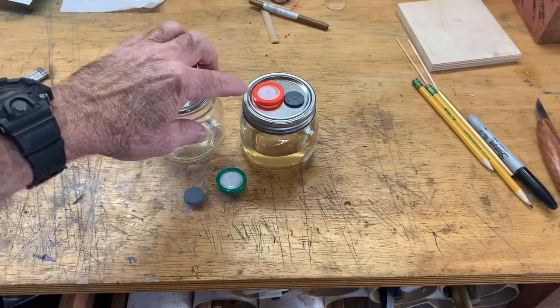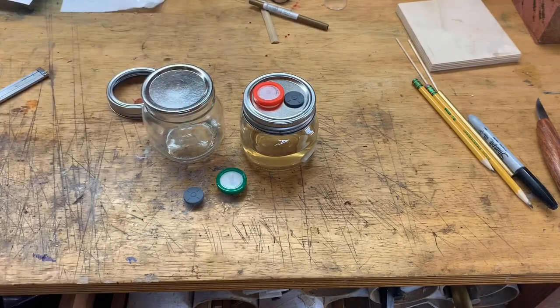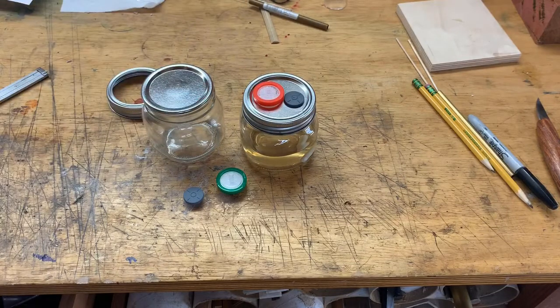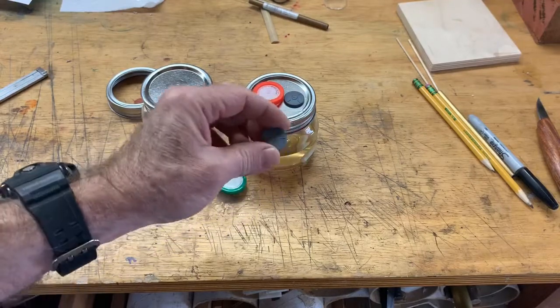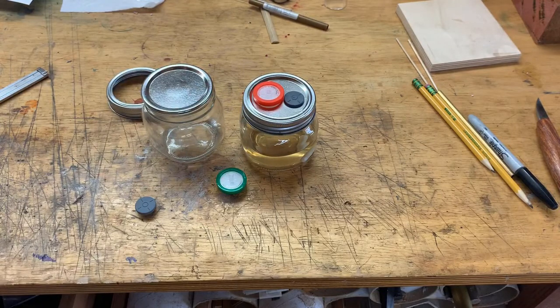The lid is a filter that prevents contaminants from getting inside the jar, but it allows the jar to breathe. That's especially important when you pressure cook. And it has an injection port. These are really convenient because you can put a syringe into there and pull out liquid — to inoculate the jar, or to use the liquid culture to inoculate something else.